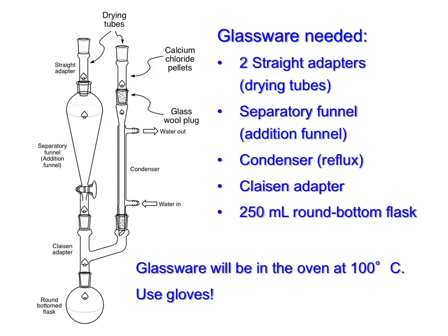So now we can talk about the practicalities of what we're going to do in lab. The glassware setup is going to look like this, and this is also in your lab procedure. We're going to need 2 straight adapters to use as drying tubes.